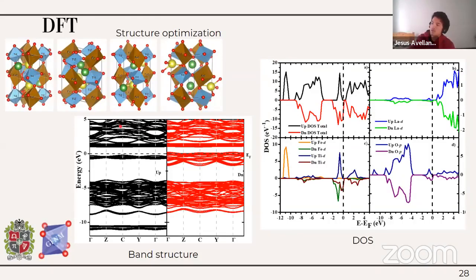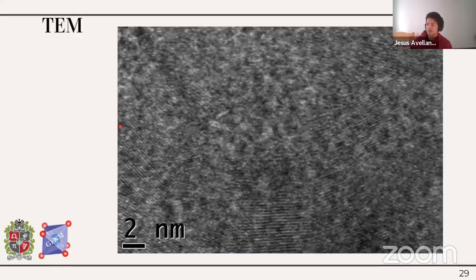Okay, so we also carried out TEM measurements with the help of Jimena when she was doing her postdoc visit. If I'm not mistaken, it was at Cambridge University. As you know, transmission electron microscopy is a powerful technique that provides us with detailed information about the structure and composition of materials at the nanoscale. And TEM basically can reveal information about the material's morphology, crystal structure, defects, composition, and more.